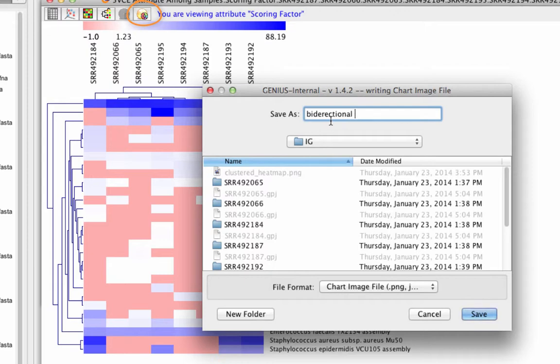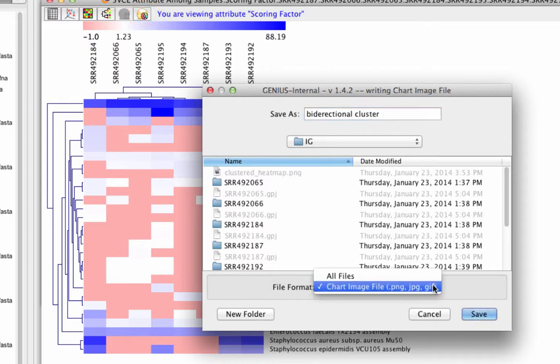You can export and save these high-quality figures and tables to be used in publications or reports.